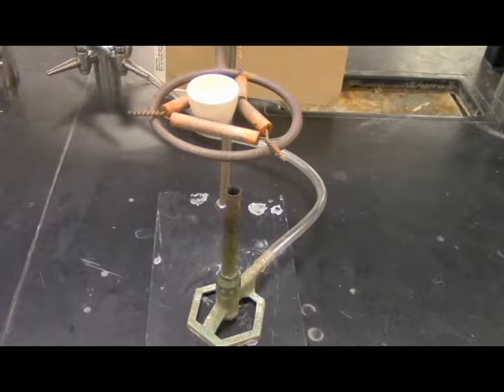In the lab, you're going to take a hydrate and weigh out a certain amount of it, put it in a crucible, and then heat the hydrate so that you drive off the water. You're going to weigh it after you heat it up, and you'll take the difference in mass before and after heating, and that will give you the mass of water. You'll use the values that you measure in lab to calculate the mass percent of water, and then with information that's given to you in the lab manual, you should be able to determine which in a list of compounds is your unknown compound, your unknown hydrate.